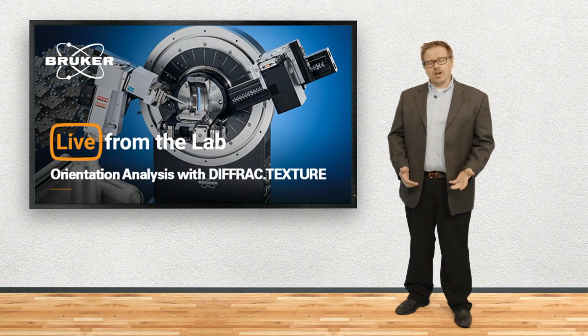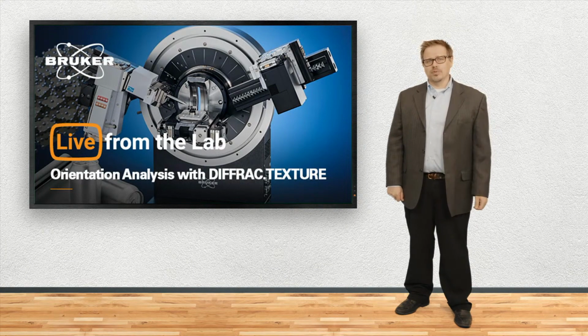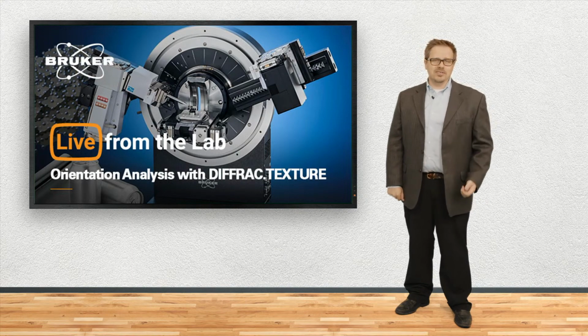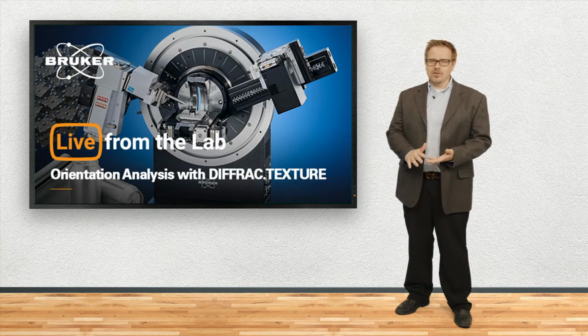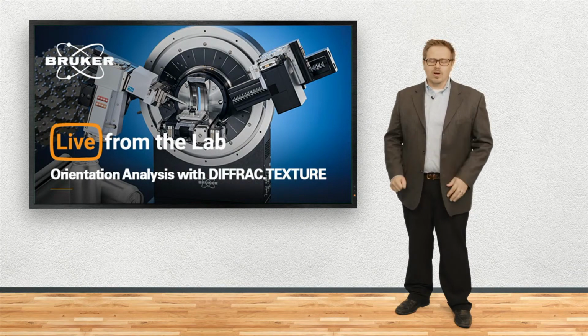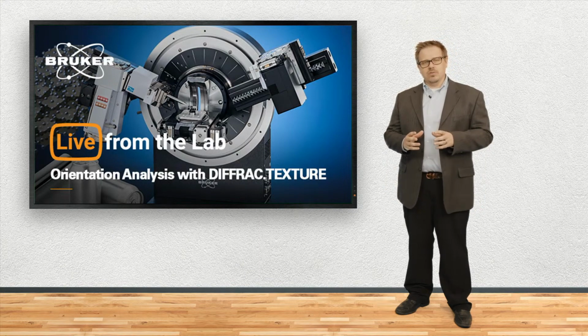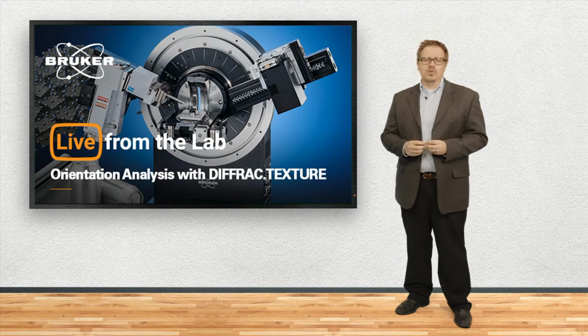This is the show where we talk about different technology that Bruker has developed to help scientists discover the world around us. Today's topic is orientation or texture analysis. Now when we talk about texture, we're not talking about the surface finish. This isn't whether it's velvety smooth or a hard surface, things like that. Rather, what texture has to do with is the orientation of the little crystals that make up the world.